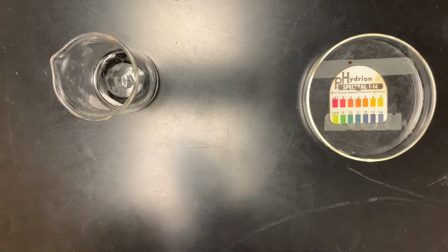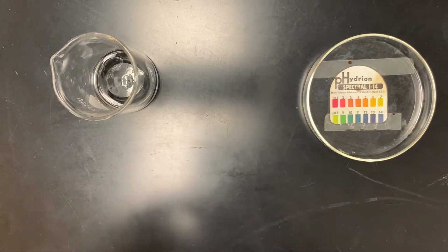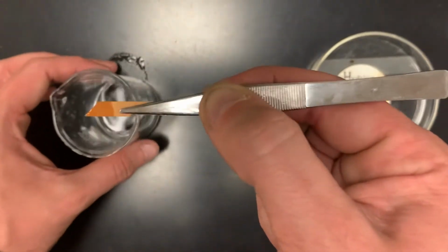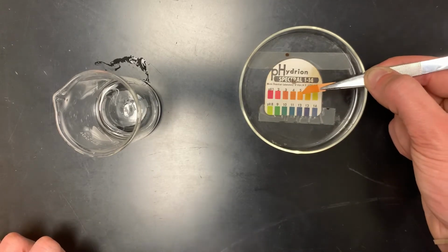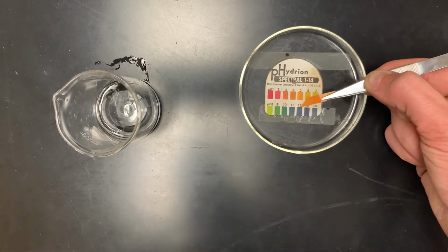Okay, so essentially what we're going to do is fill out the data table for part 3 of this lab together. The first data point we're going to take is that of water. Now what I have here is distilled water. I take my pH paper and I test the pH. What we identify is that it has a pH somewhere between 5 and 6. It's really common for distilled water to have a pH of about 5.8.